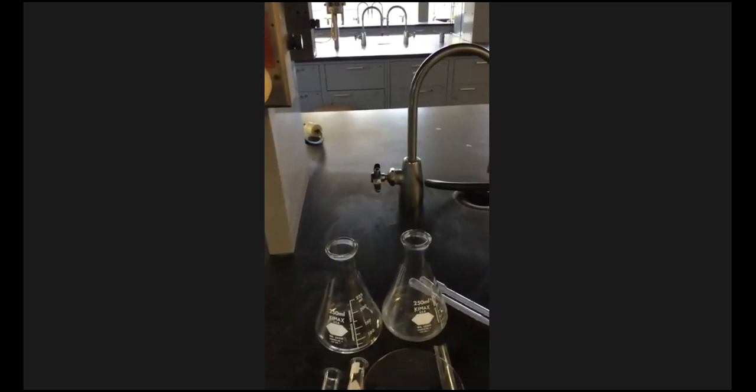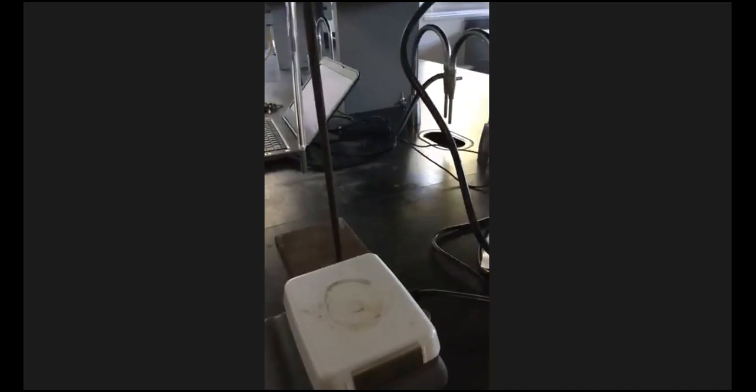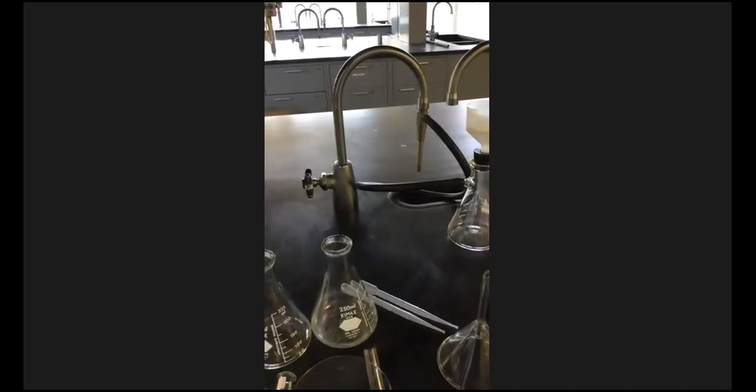So we have a 250 ml beaker. We got a hot plate. We got a thermometer. We got everything we need over here. So we're going to go ahead and take this 250 and we're going to weigh it. Hopefully the balance can go up to this mass. Yeah, the maximum mass of the balance is 510 grams. So we're going to weigh this 250. And again, anytime you get ready to take the mass of anything, you want to zero out your balance and then boom. So where it says in the report sheet, the mass of beaker, you should write this number down, 92.66 grams.